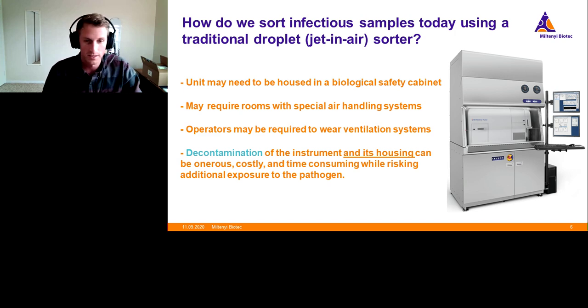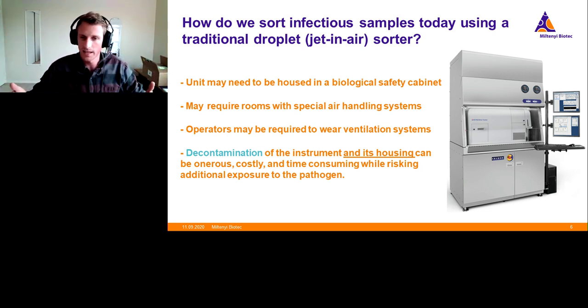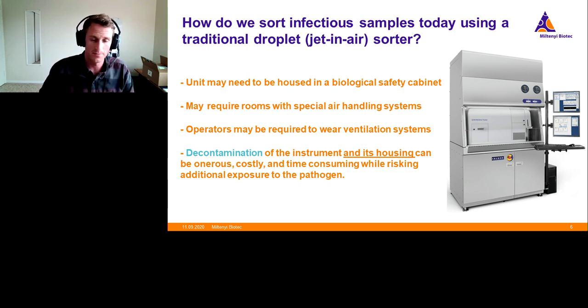So I've always been quite impressed with this. The difficulty here is obviously that you're spraying cells through the air in a space where humans are trying to do their science as well. So the way that that's mitigated is whole sorting systems are placed inside of biosafety cabinets, which can help minimize the amount of aerosols that actually make it into the room.